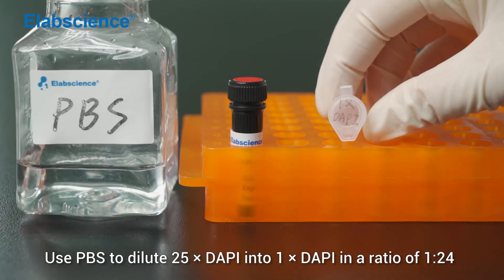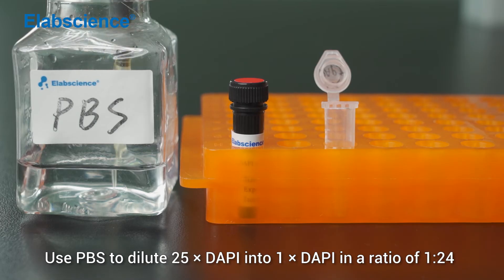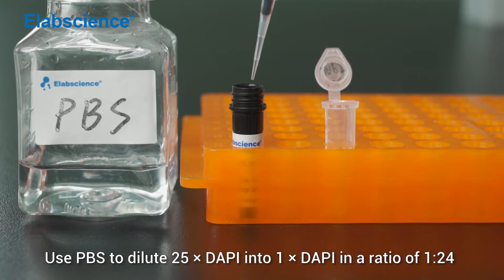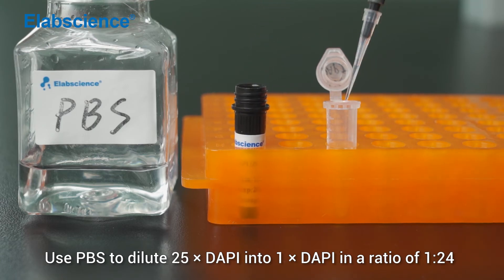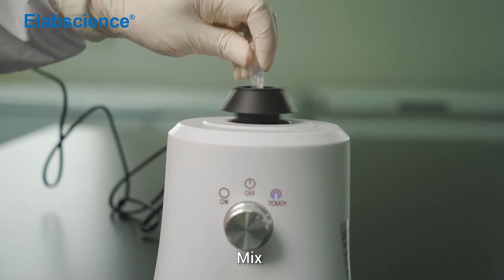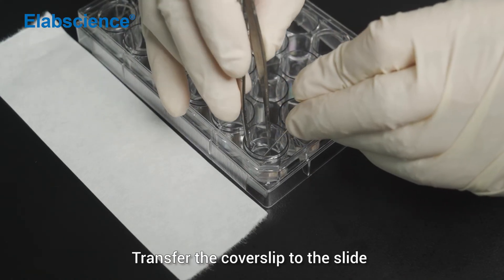Use PBS to dilute 25x DAPI into 1x DAPI in a ratio of 1 to 24. Mix. Transfer the cover slip to the slide.